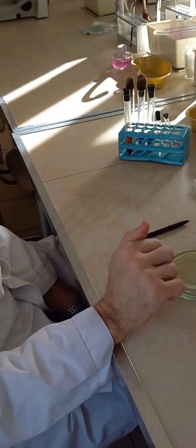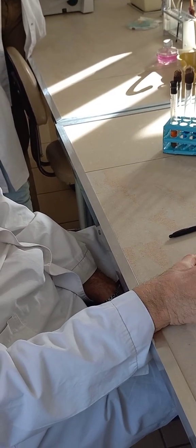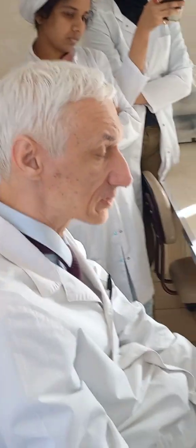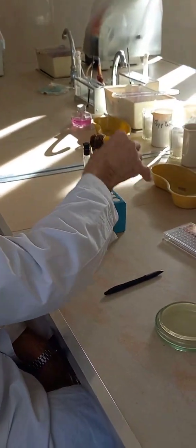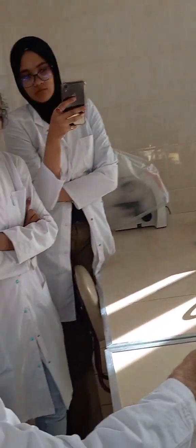Staphylococcus typically, 80-85% of Staphylococcus genera members, if it produces lecitinase, it will be Staphylococcus aureus. This is one thing. And the last biochemical reaction. This is diluted rabbit plasma, diluted 1 to 4, to my mind, 4 times diluted. So people, Staphylococcus produces an enzyme known as coagulase.